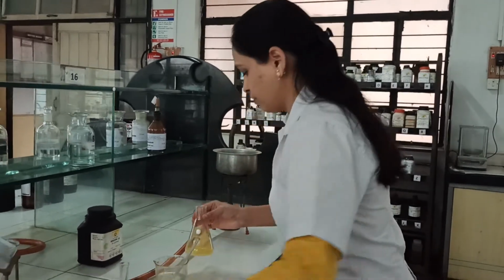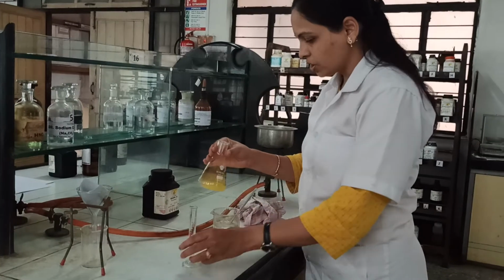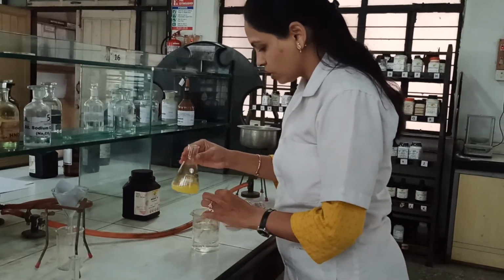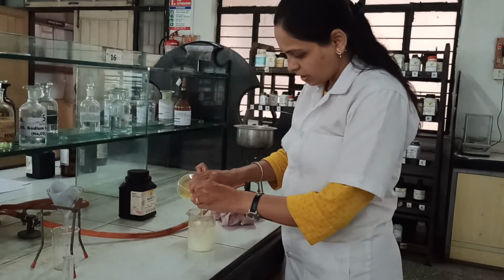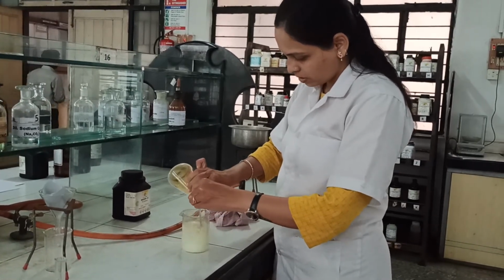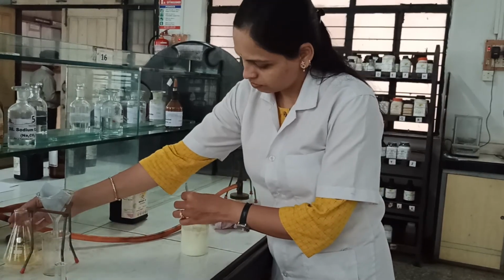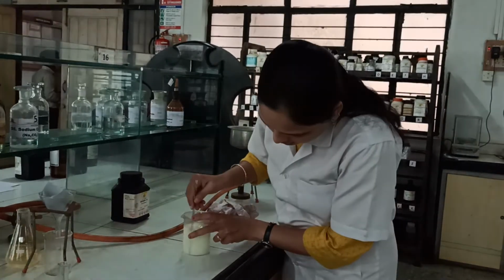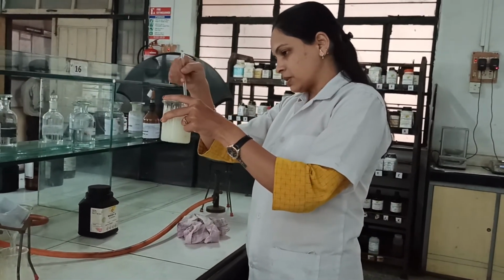Now we have to transfer this reaction mixture into ice cold water with continuous stirring. And again you can observe in this beaker that product formation takes place.